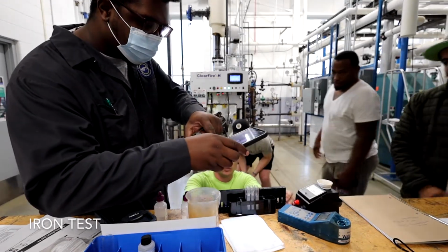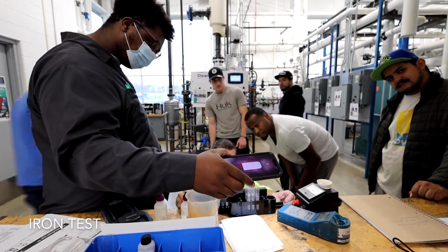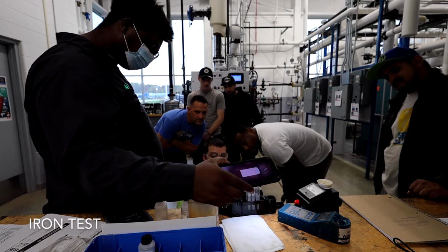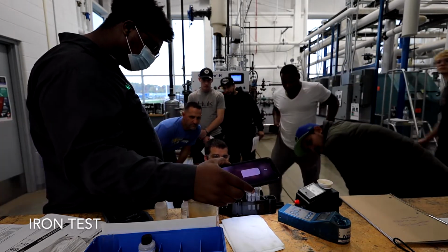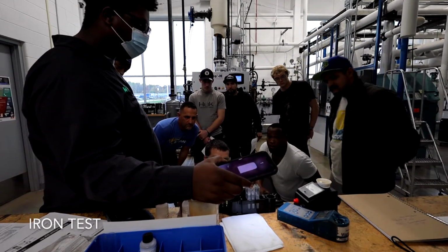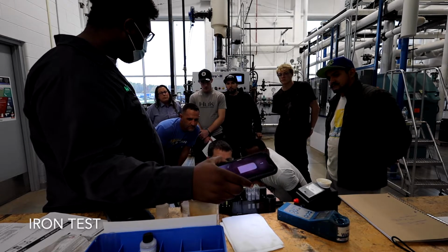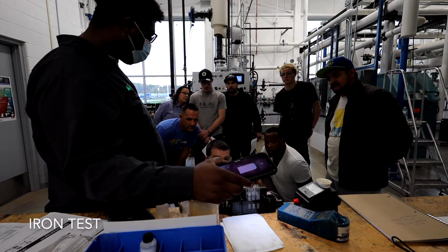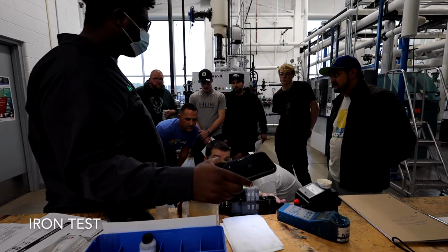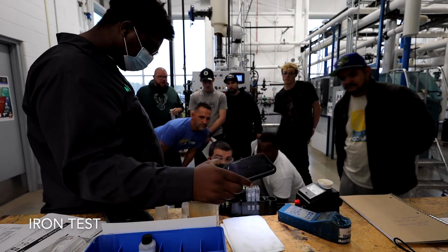Then what we want to do is slide this to where our middle one matches what we see. On this one, for example, this white line is what we're reading. To the right of it is 0.1, to the left of it is 0. You move it along these lines, so now it's going to be 0.1 and 0.2, and try to match the center one to what you're thinking. I'm going to say we're all the way here, so it's between 0 and 0.1, which is great.